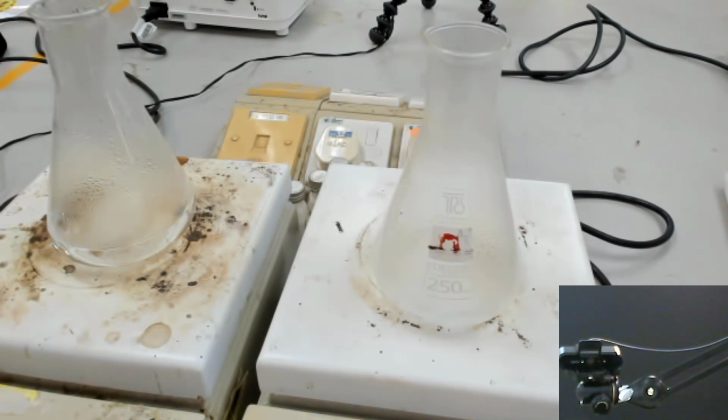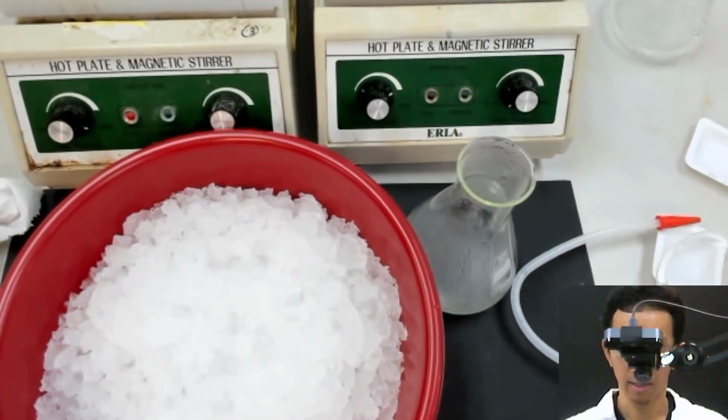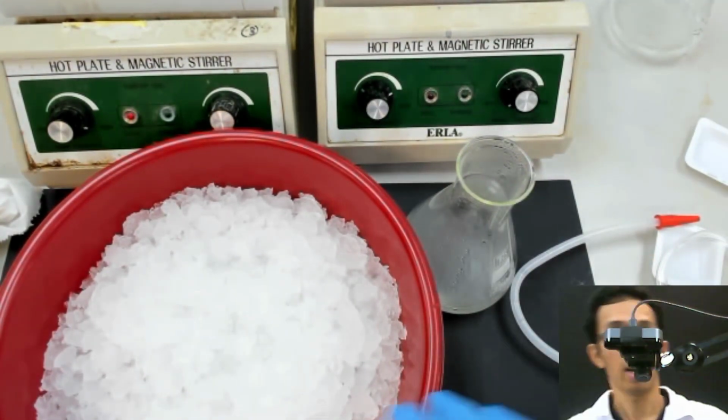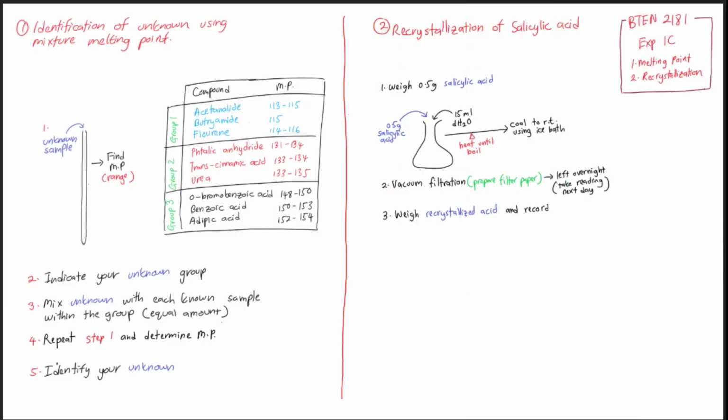Okay, so that is the ice. In the procedure it says cool to room temperature using the ice bath. So this is just the ice.